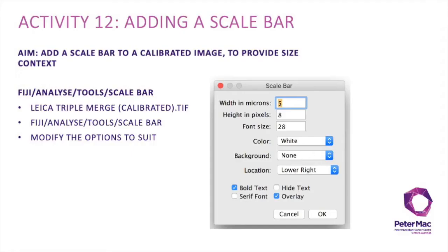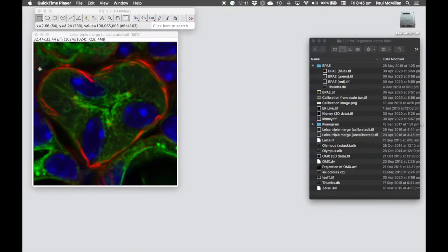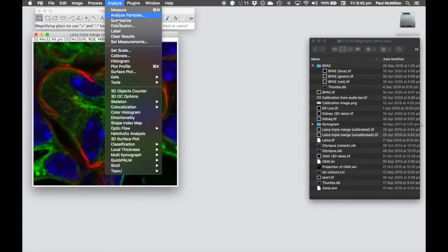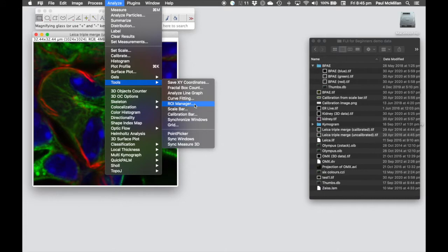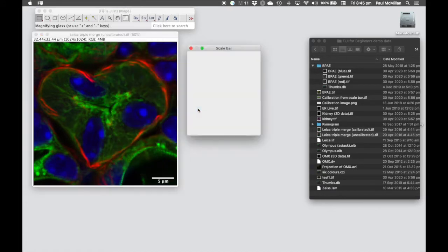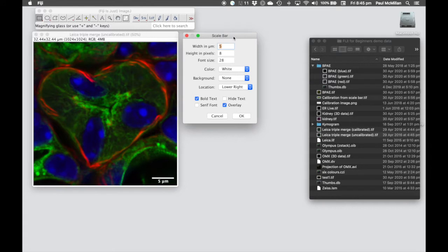Activity 12 is adding a scale bar into your image, allowing people to understand distances and physical sizes within the image. Now that we've calibrated the image, we can add a scale bar. We go to Fiji Analyze, Tools, Scale Bar. This brings up a dialog box where we can change the width in microns — choose something that makes sense for the image size — and the height in pixels to make it look like a bar.